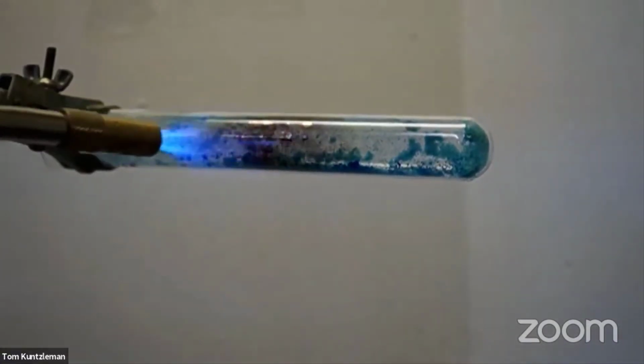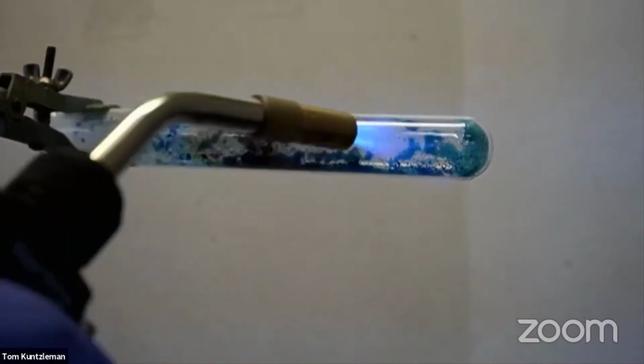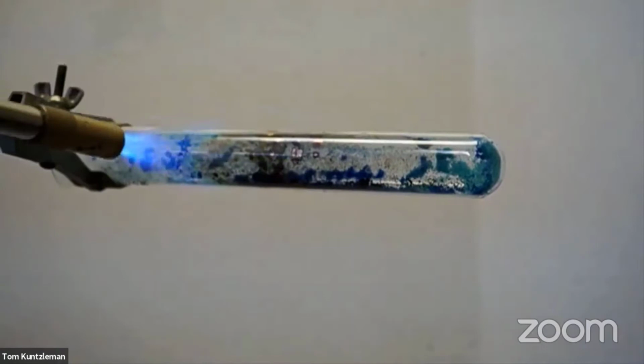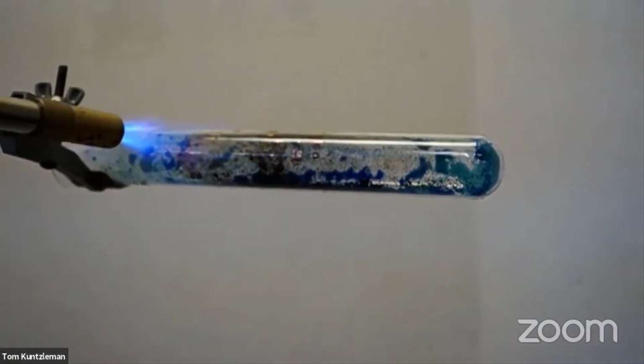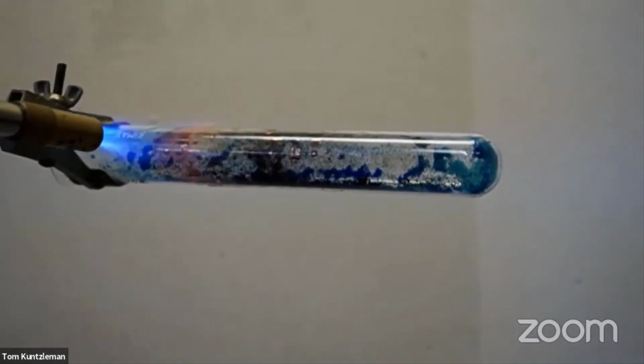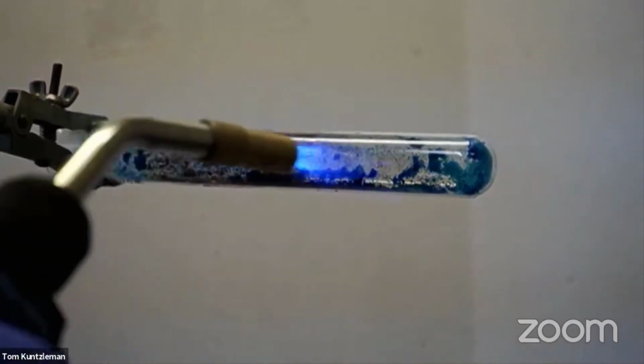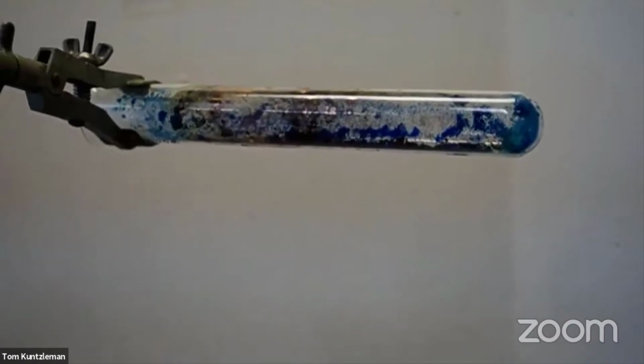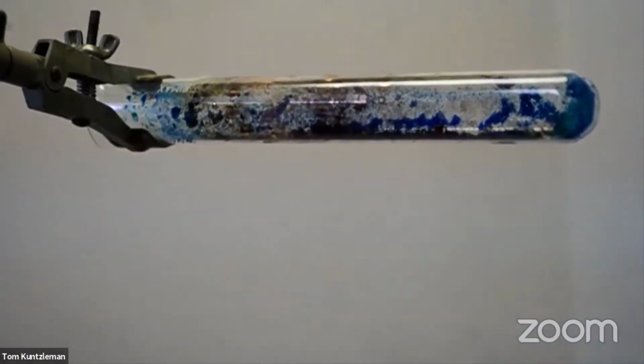Oh, look at that. You see right there. I don't know about you, but that looks kind of shiny.